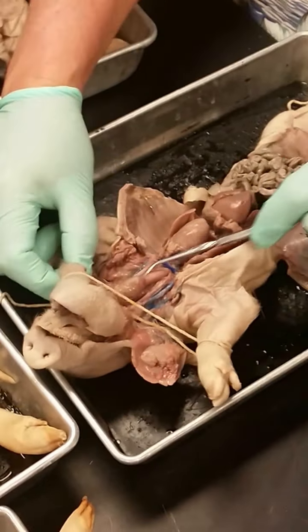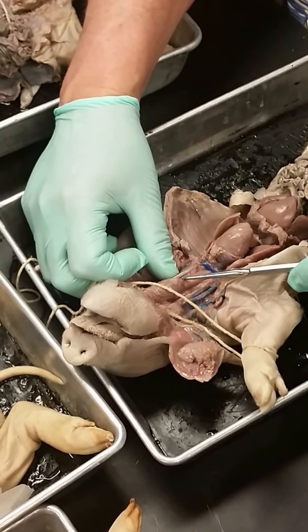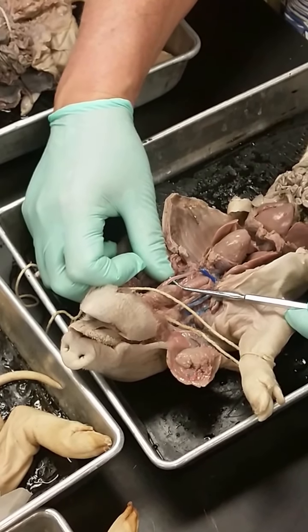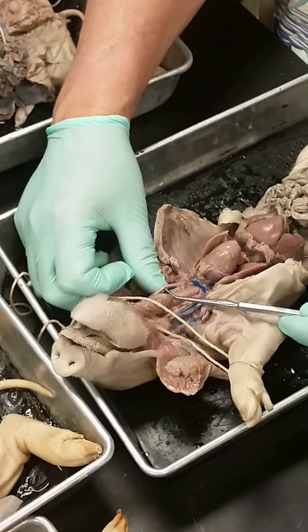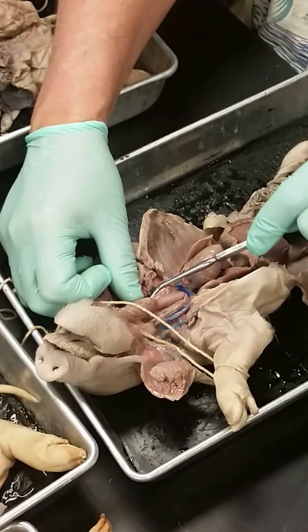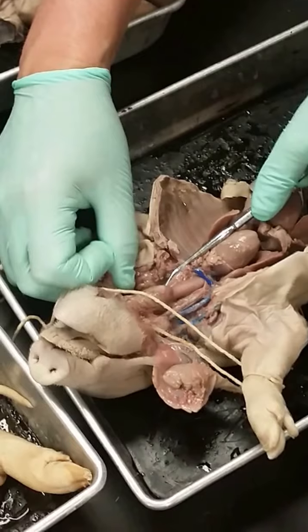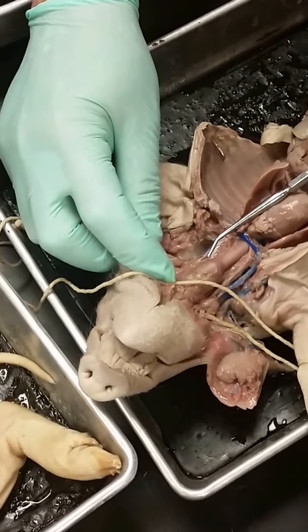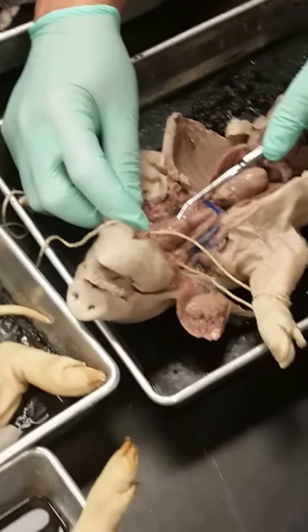Then along this, lateral to the trachea and the larynx, you've got this blood vessel. They're bilateral. These are the common carotids. And running right alongside the common carotid, a little white thread, which you can just make out right there. Can you all see it? That would be the vagus nerve.